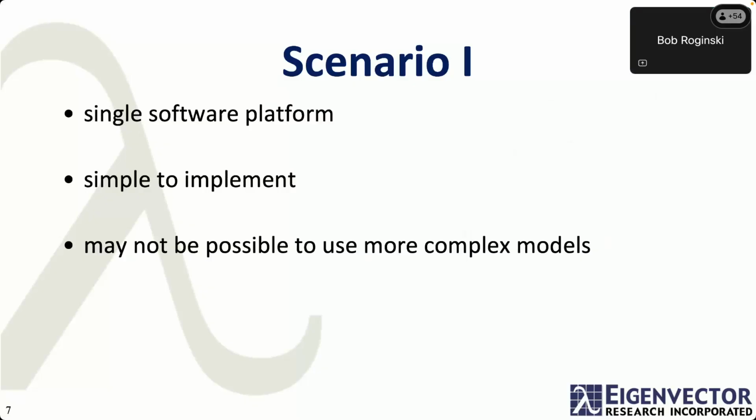So the thing to highlight here: this is a single software platform, pretty simple to implement. But where might you be limited? It may not be possible to use more complex models. At this point, you're limited to what is available to you from that instrument software.